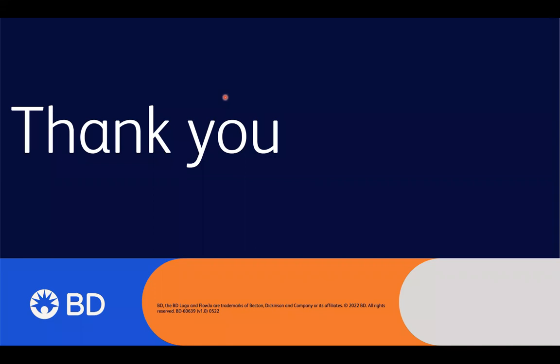Where can we find the recorded webinars? Let me exit out of this and go into FlowJo proper, and then that way it'll help. It's kind of weird using the pointer here. I actually have to escape out of the slideshow here.